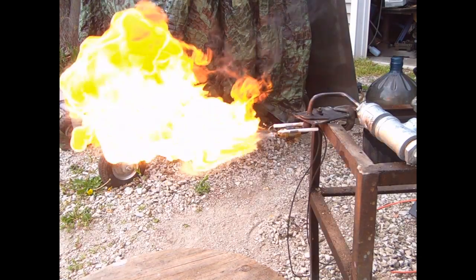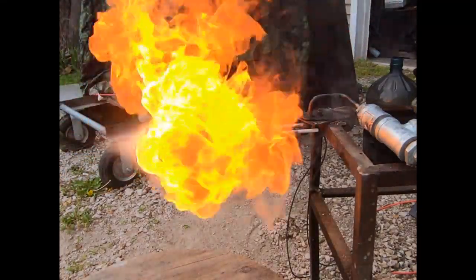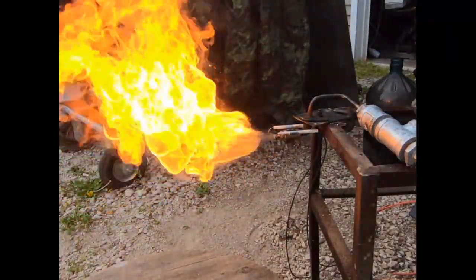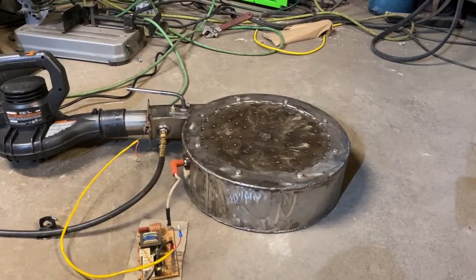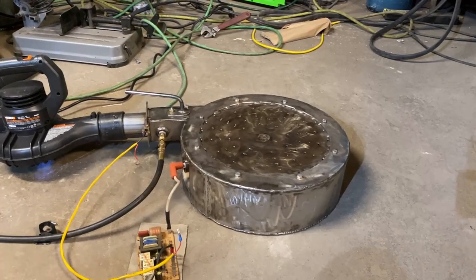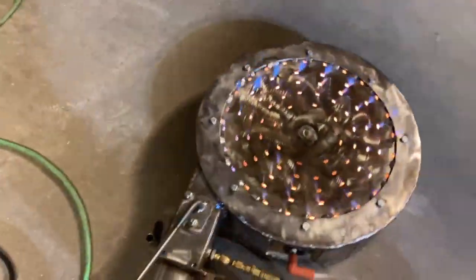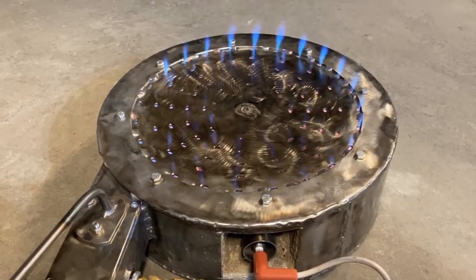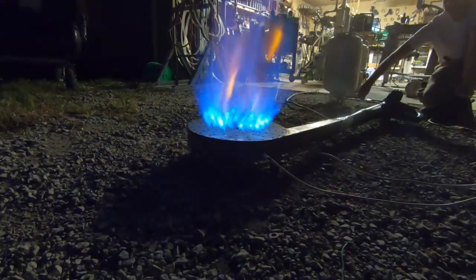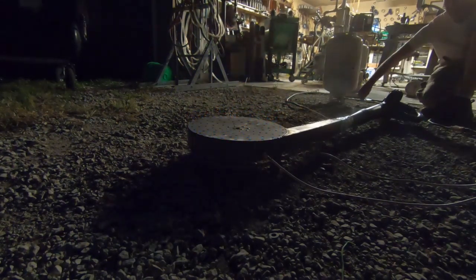The only reason I started off with the spark plug ignition is because when I ran the banjo burners on just propane the spark plugs work fine, but for diesel they cause an explosive scenario. So right here we have a propane banjo burner — I've done a lot of propane testing with these burners and the spark plug setup is one of the best ignition configurations. Never had any problems with this setup, and in the preliminary testing we can see the spark plug did just fine.